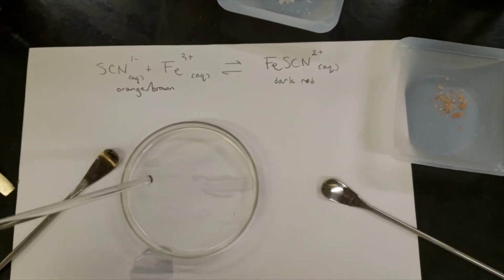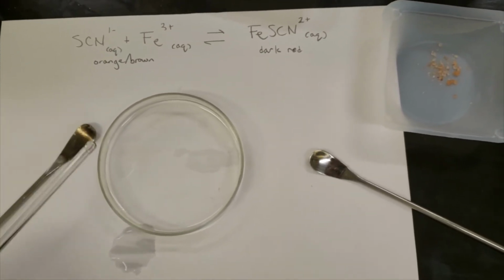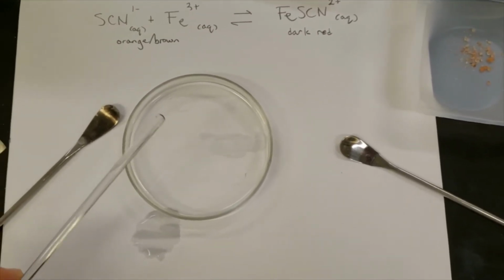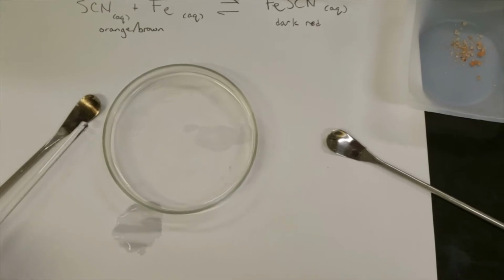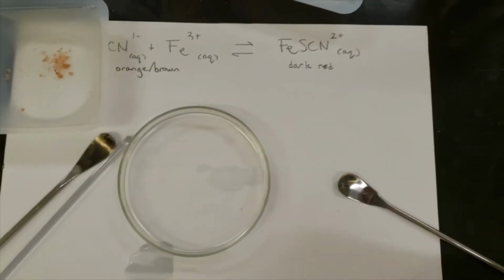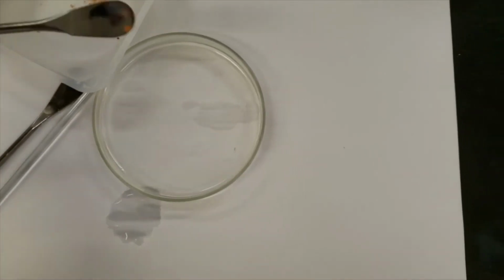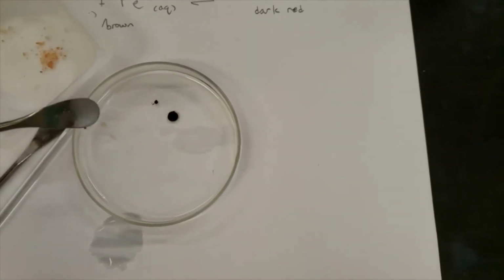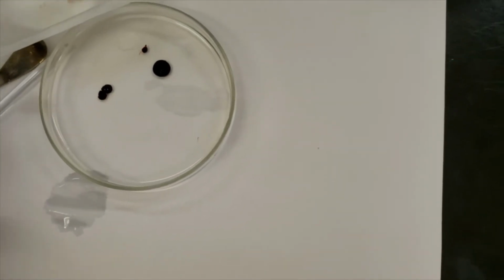Okay, so what I'd like to do here is demonstrate an equilibrium reaction in solution. In the Petri dish here, I have a solution of potassium thiocyanate. For us right now, the important ion here is the thiocyanate ion. Next, I'm going to add a few crystals of iron 3, because technically it's iron 3 nitrate. We'll see what happens.